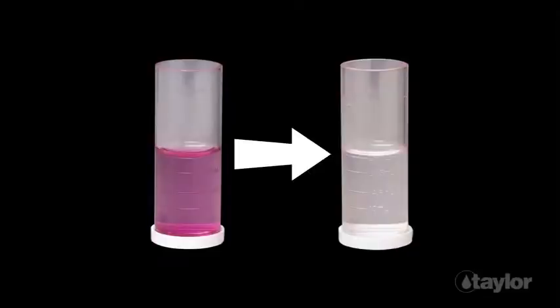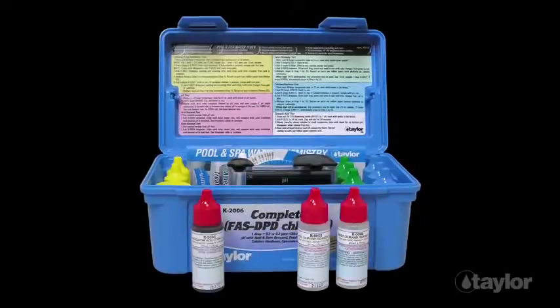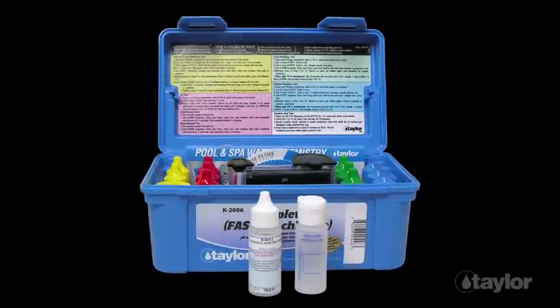The tests in the K2006 complete kit include FAS DPD titration to measure free and combined chlorine, pH, both acid and base demand tests for adjusting pH, total alkalinity, calcium hardness, and cyanuric acid for outdoor pools and spas using this chlorine stabilizer.